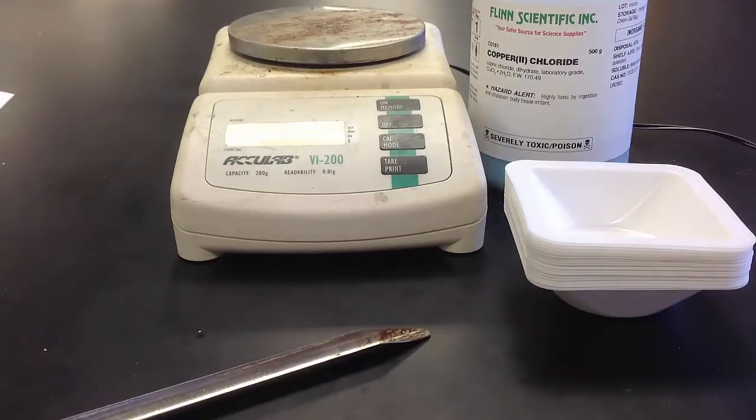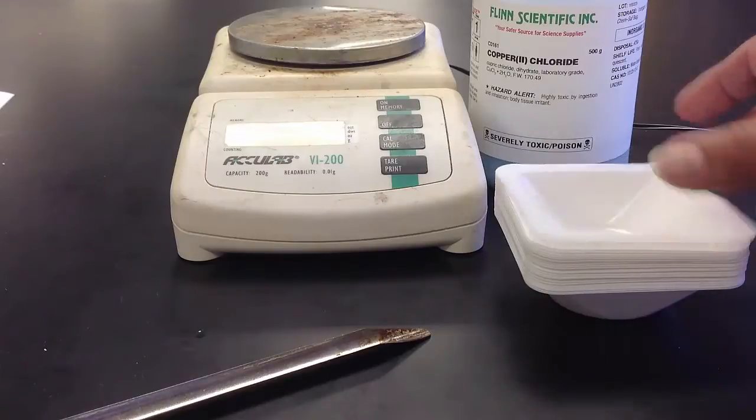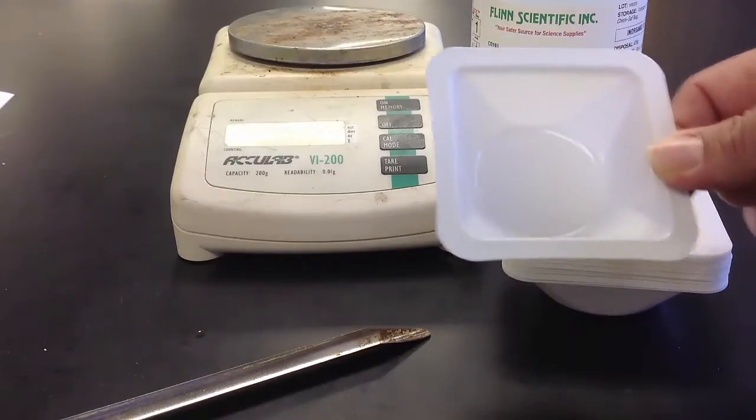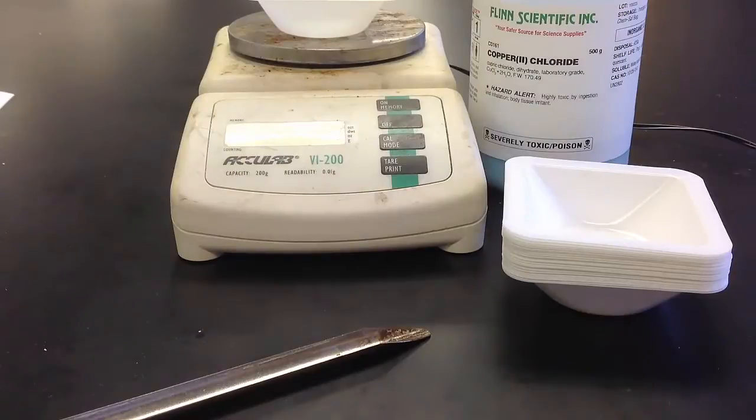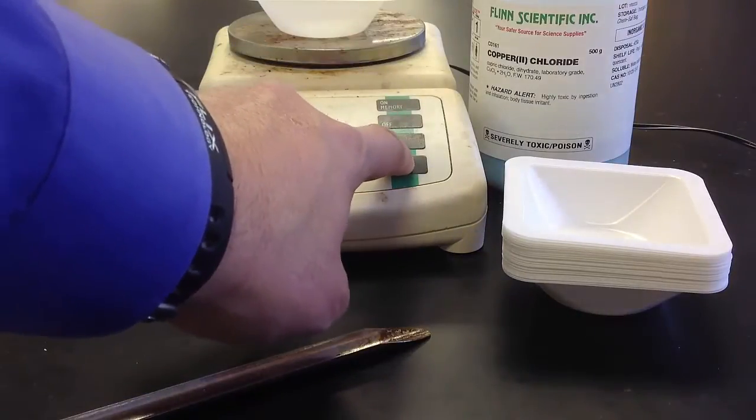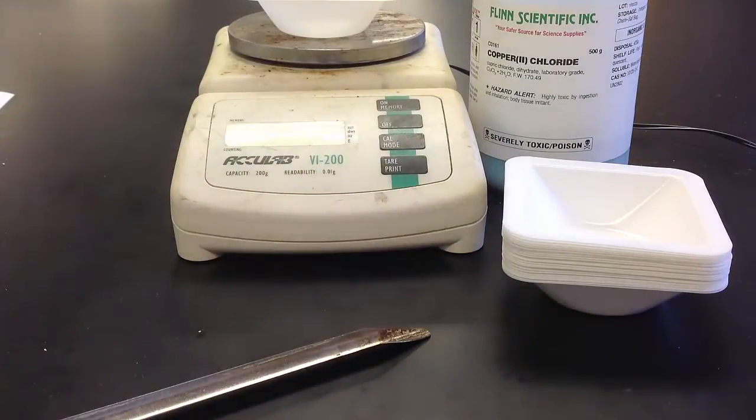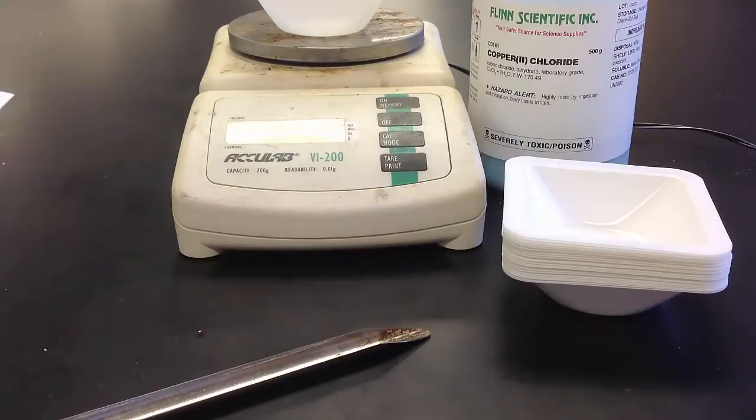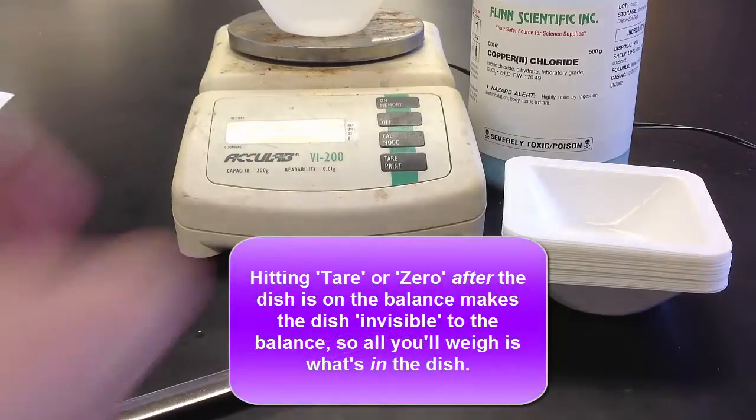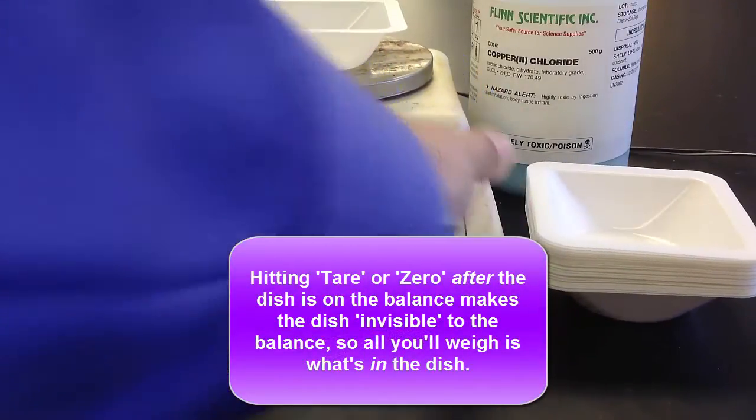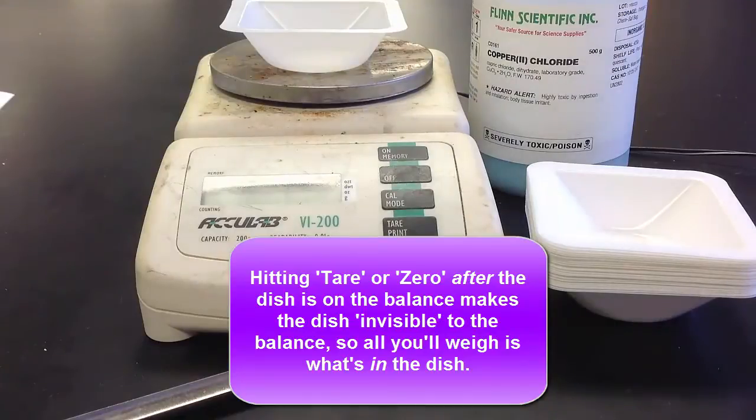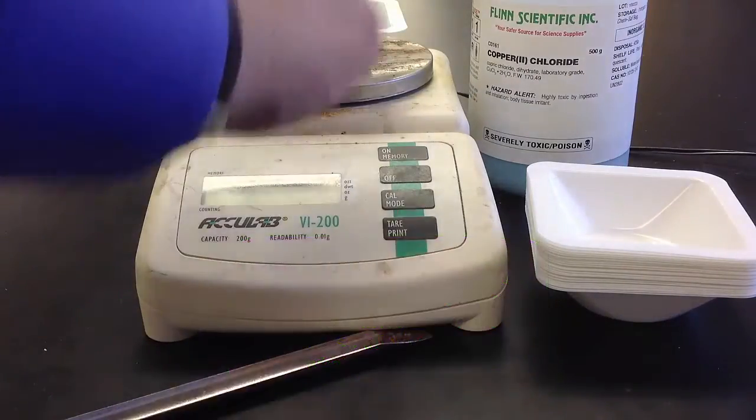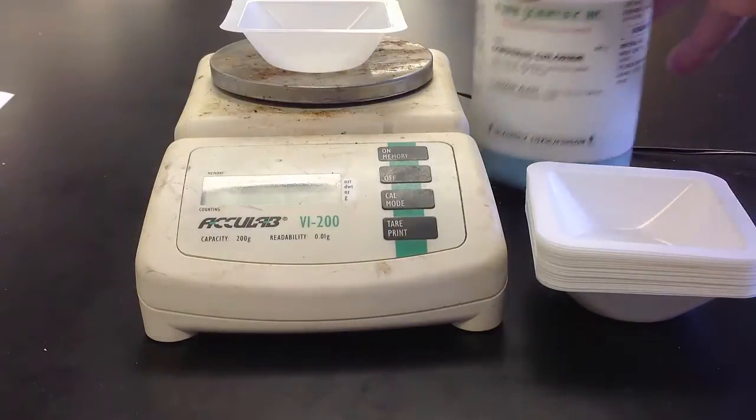And then we're going to take a weighing dish. This is a weighing dish, a little plastic dish. And we're going to put it up on top of the balance pan. And we're going to press the tare or zero button again. And we're going to do that so that the balance effectively doesn't see the weighing dish. The weighing dish becomes invisible to the balance if we do this. So we put the weighing dish on, we hit the zero button.